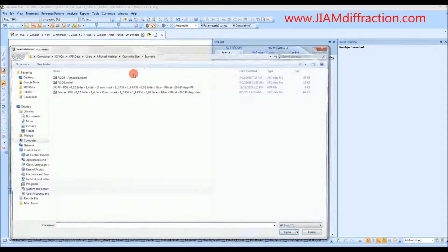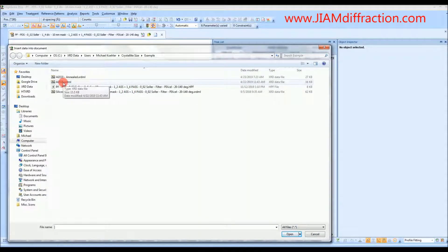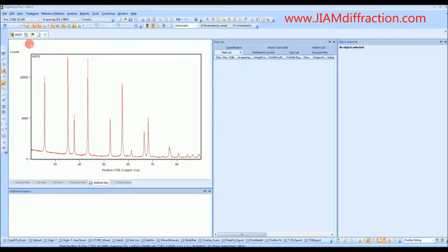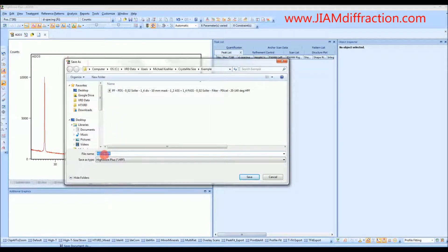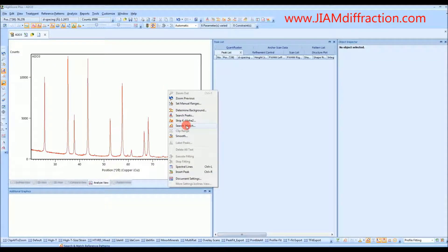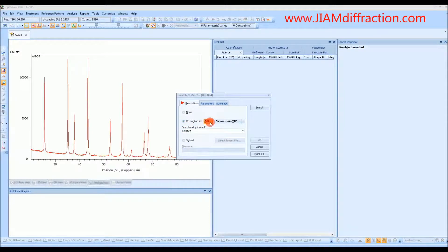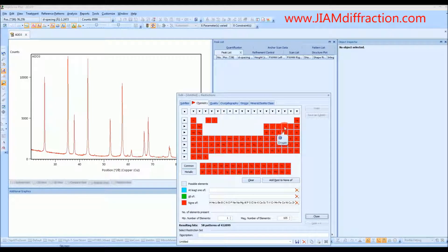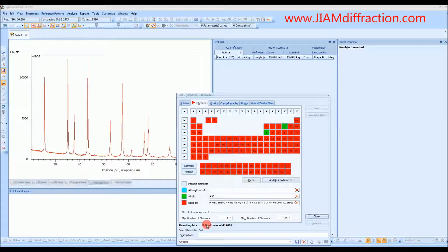Now we can import our first data file. We'll choose the regular Al2O3 file, then File, Save As, and we'll just use the same name that the XRDML file had. Now we're dealing with Al2O3, so we will right-click, search match. If you have a more complicated pattern, you can first determine background and search peaks if you like, but I already know this is Al2O3. So I'll edit the restriction set, and we'll do O and Al. That gives us 354 patterns; if we make it so that both elements have to be in every search pattern, that brings it down to 199.